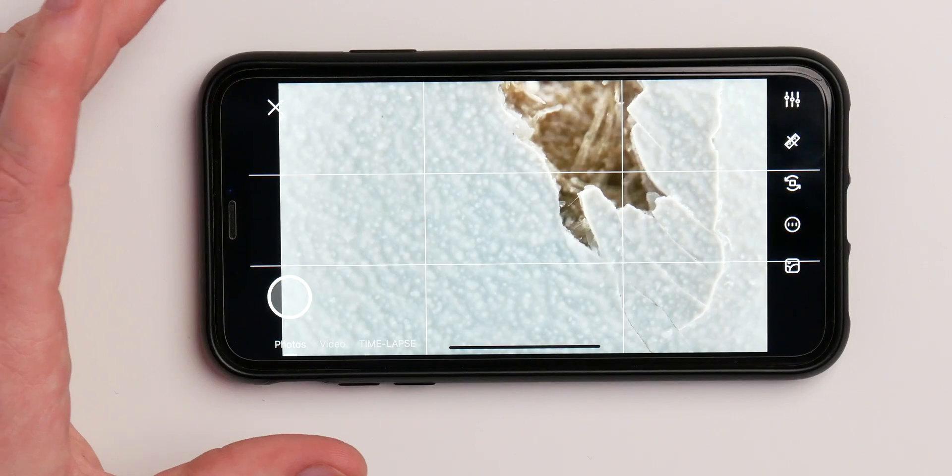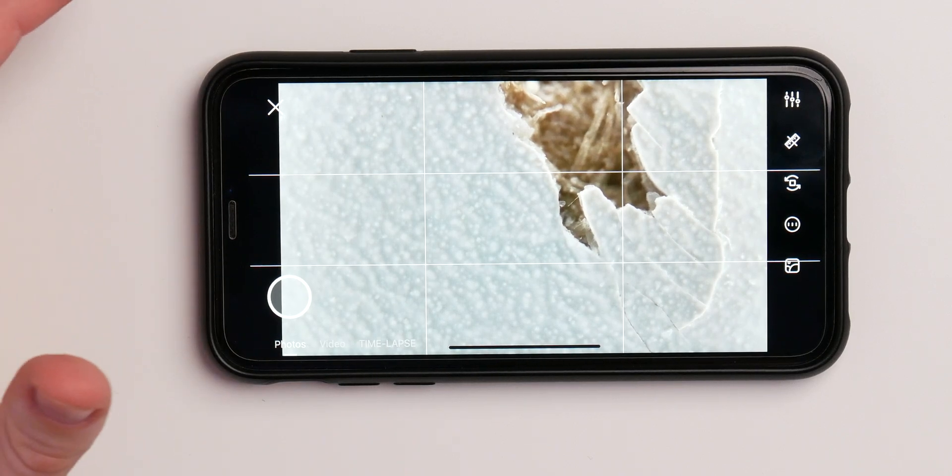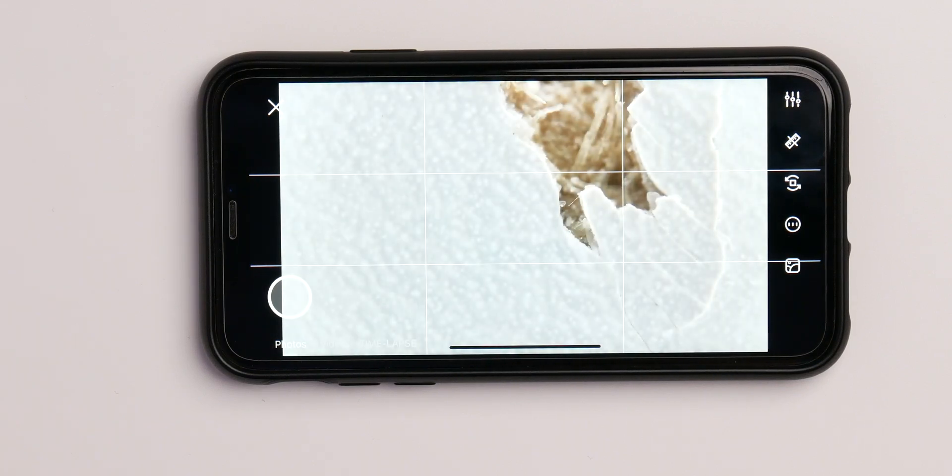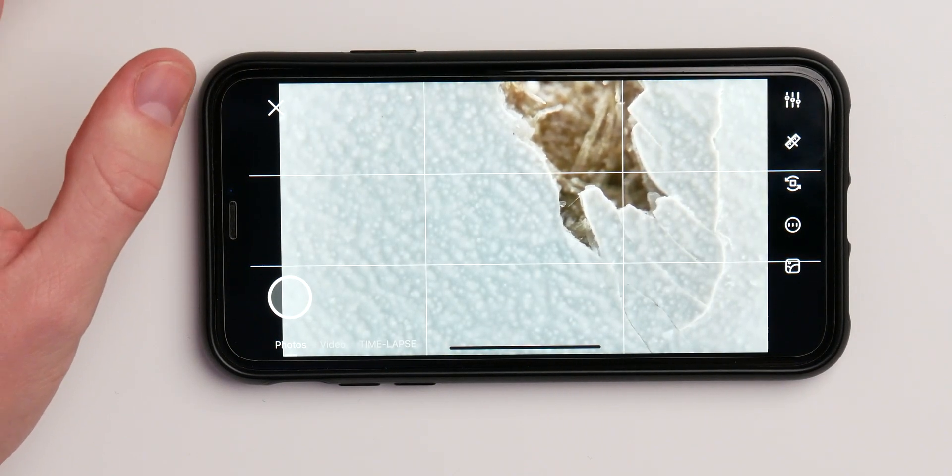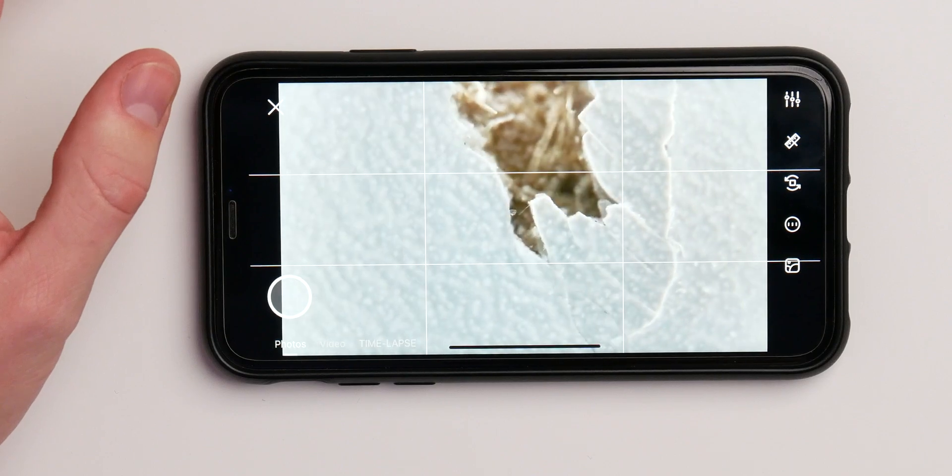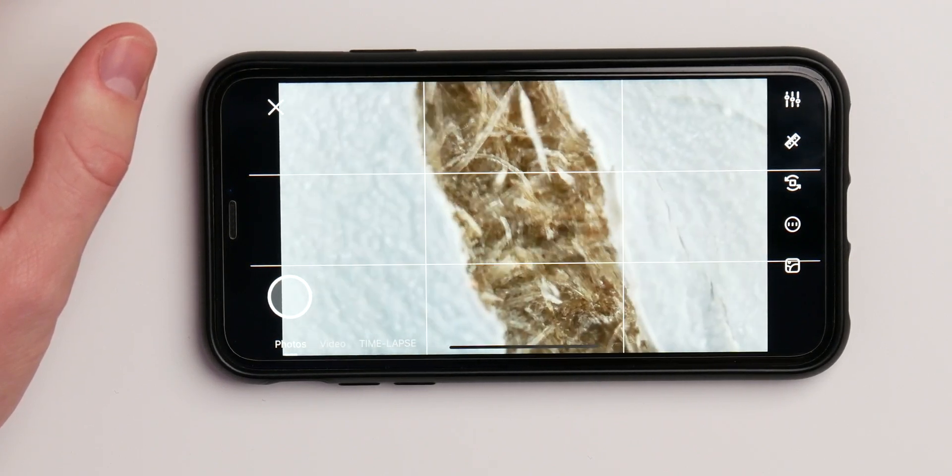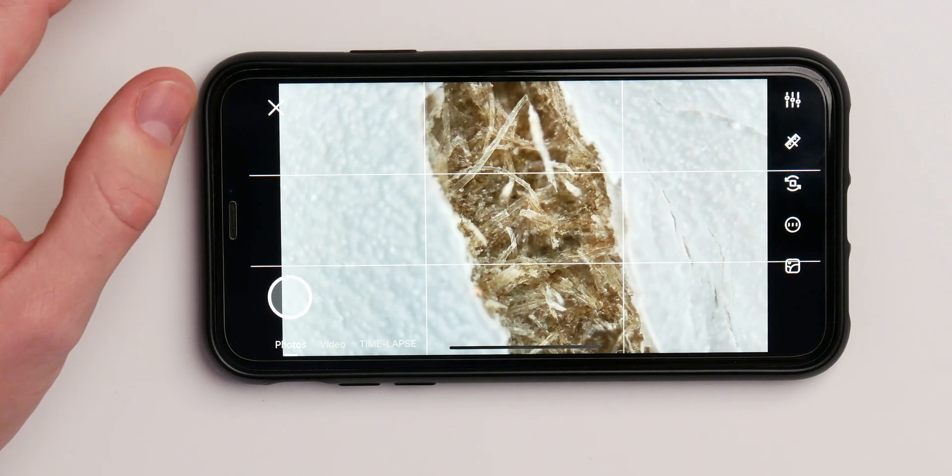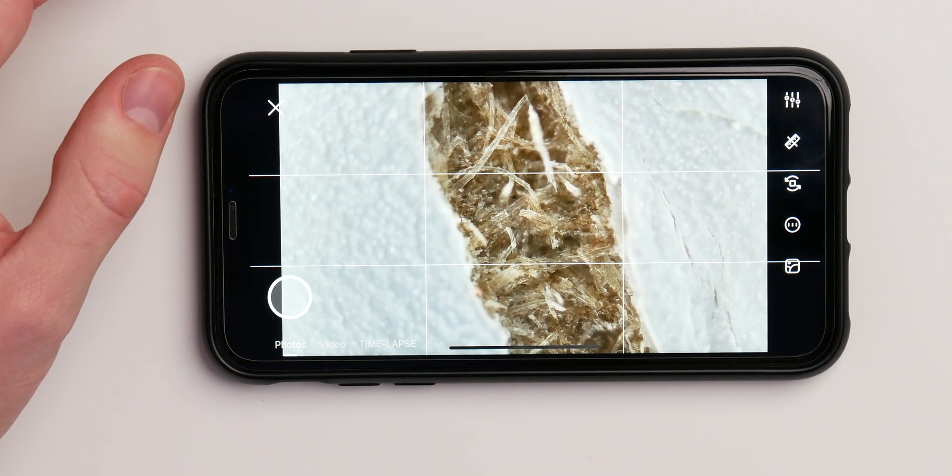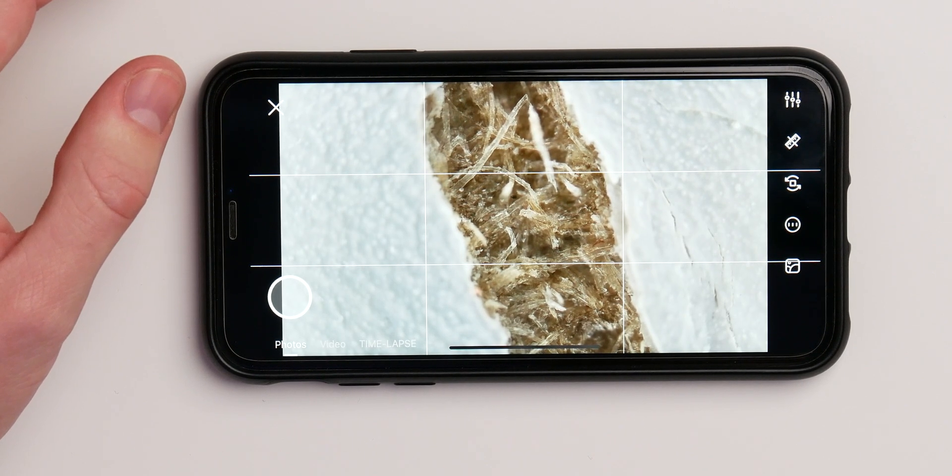This is now super cool because now I'm pointing the camera here at a specific spot on my table where I dropped a camera a couple of weeks, months ago. I really regretted it because it's just so heavy, it was in the cage. So I dropped it on the table and it cracked open the coating or the painting of this table so we can just take a look at it. In my opinion just really, really interesting how this looks like. It's not real wood as you can see at this point, but super cool.